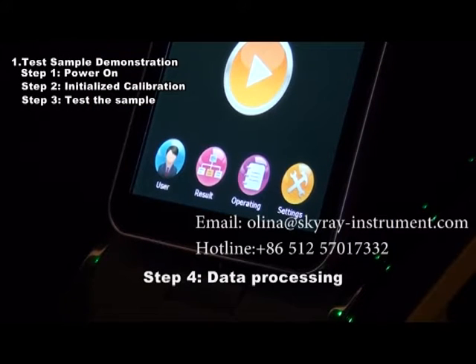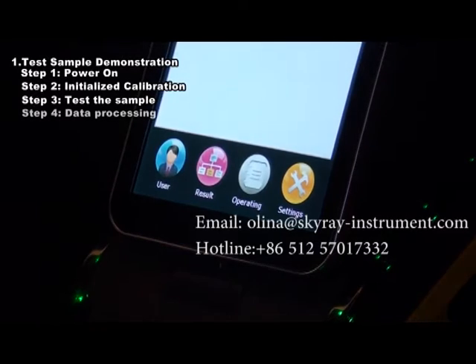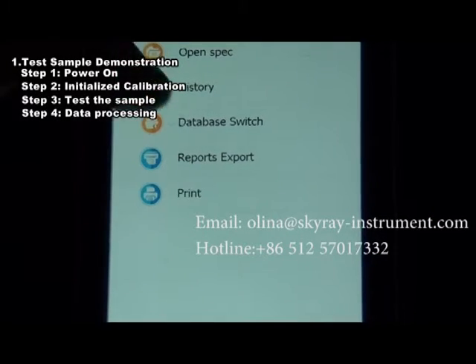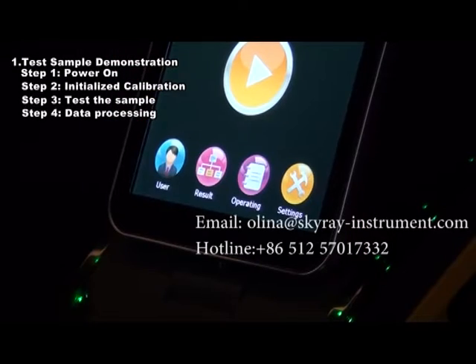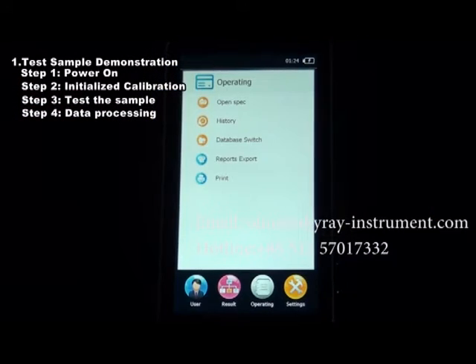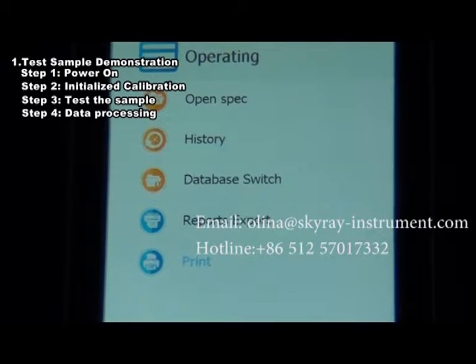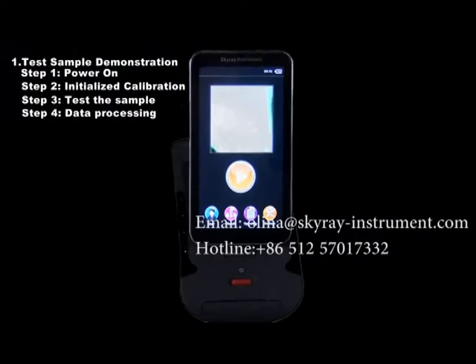Step 4: Data Processing. Report Print — click the Operate Print button to connect to the Bluetooth printer and print the test report of the current sample. Report Export — click the Operate Report Export button to export the safety report into a memory card. The report can then be copied into the computer for viewing and printing.